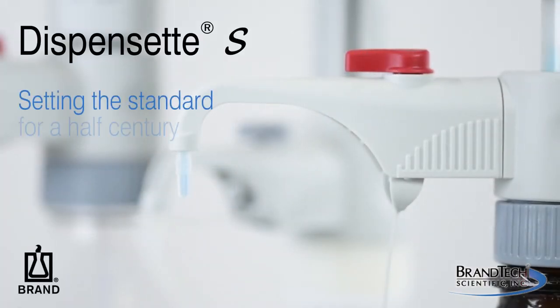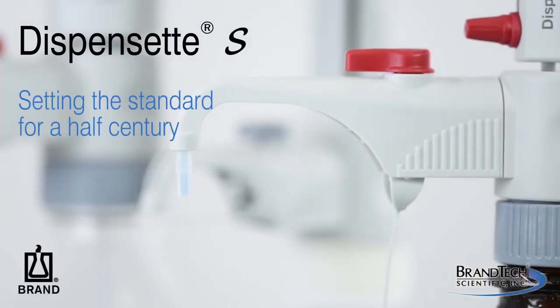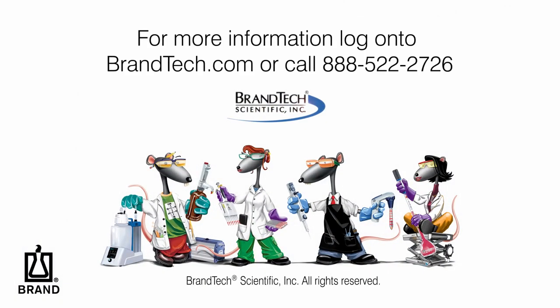The new Dispensette S bottle top dispenser — setting the standard for a half century. For more information, visit Brandtech.com.